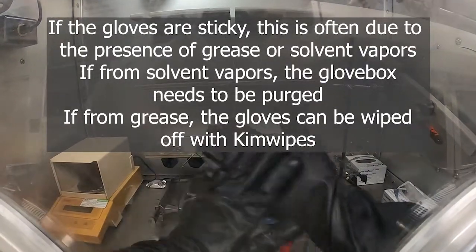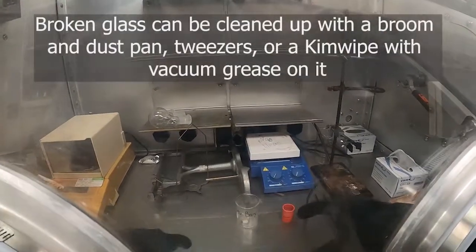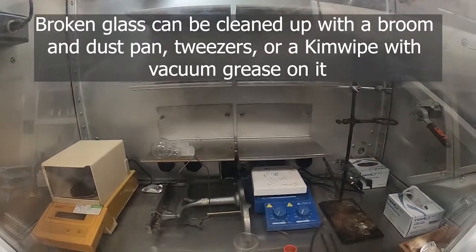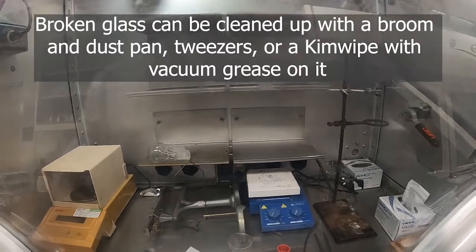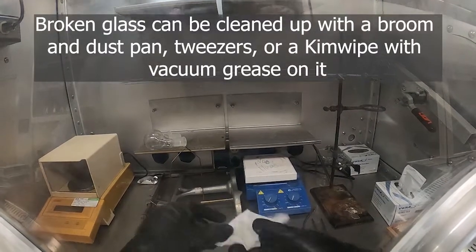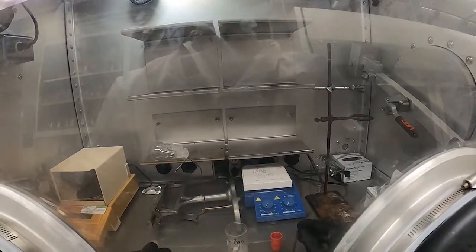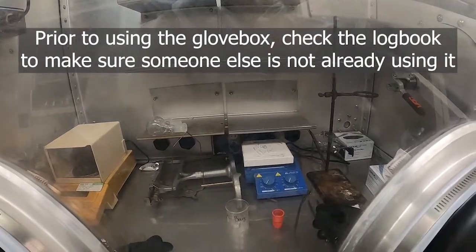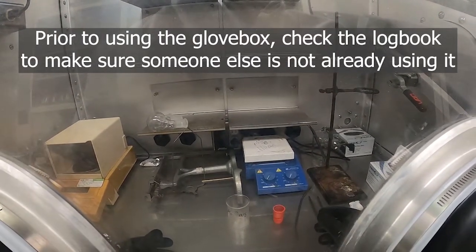If you find that the gloves are sticky, that means the glovebox needs to be purged — it's got solvent vapors in there that can cause the gloves to be sticky. If you do have any broken glass, it can be cleaned up with a small dustpan brought in and kept inside, or with a kimwipe — put a bit of vacuum grease on a kimwipe, use it to dab up pieces of broken glass, contain them carefully in the kimwipe, and put that in a trash receptacle. Many gloveboxes will have a log book — make sure you check it to see if the time you want is available.